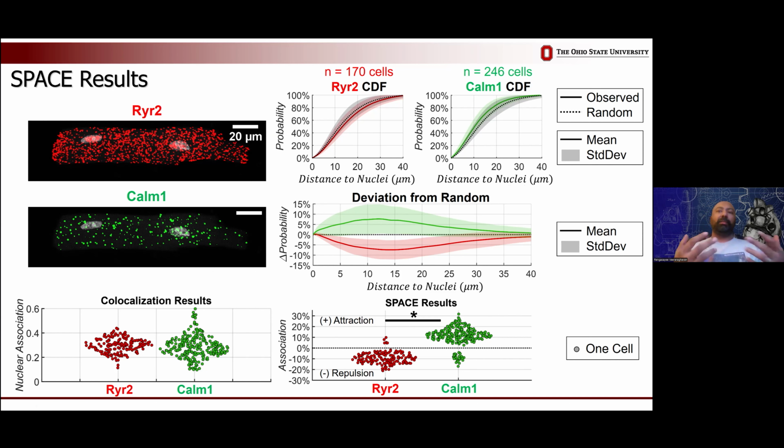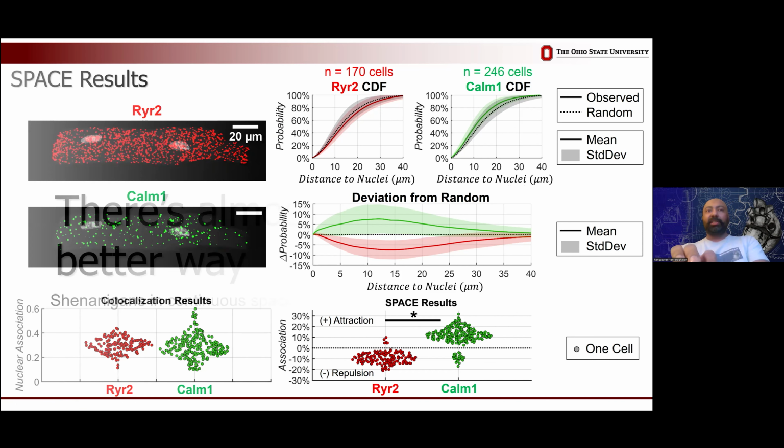What this really means in biological terms is the RNA in red is being trafficked much more efficiently away from the nuclei than the green. And we would have missed all of this beautiful difference in the biology if we were just driven by a smaller subset of information using old school analyses. So this is the discrete case.